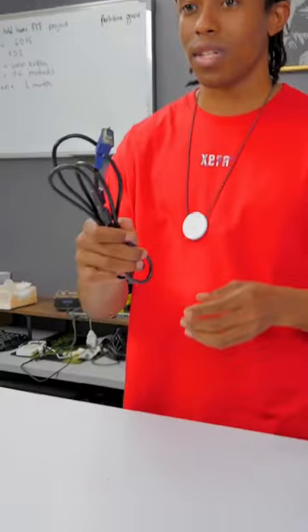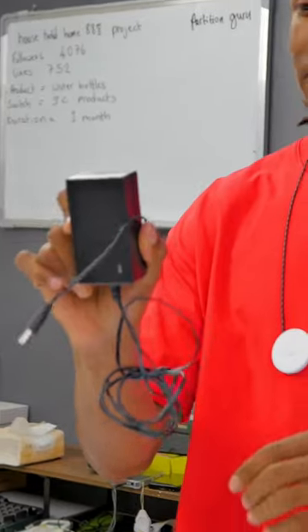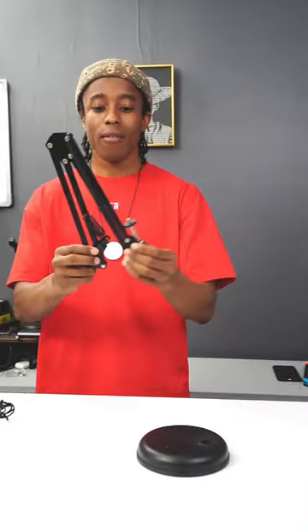There are many different types of microscopes out there. What you need is your microscope, a nice monitor, a VGA cable, a 12 volt power supply, and a base stand for the microscope to be connected to.